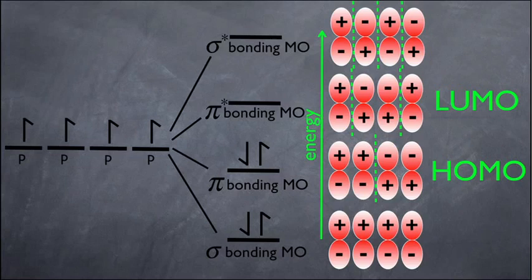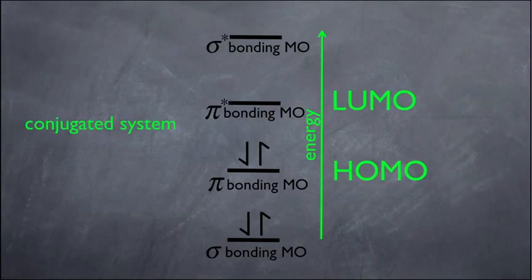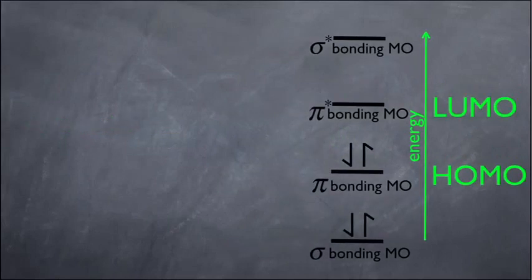All right, so what happens here is this: this becomes yet another way to characterize our conjugated system. That diagram is, like I said, a way to describe a conjugated system. And this is what's going to help us understand how the UV spectrometer works. Remember, for all of these machines, we have to understand, number 1, how the machine works, and 2, how to read the data. For this machine, it's harder to understand how it works, but easier to read the data. But if you've followed me so far, you're going to be able to understand this machine. So here's what happens.